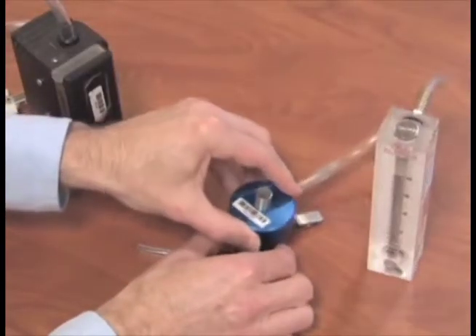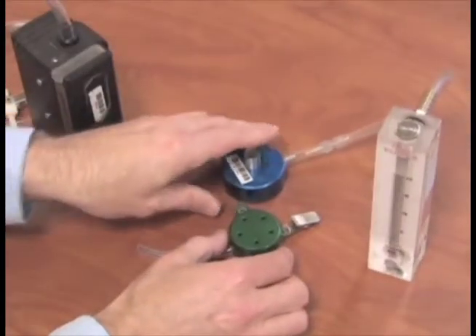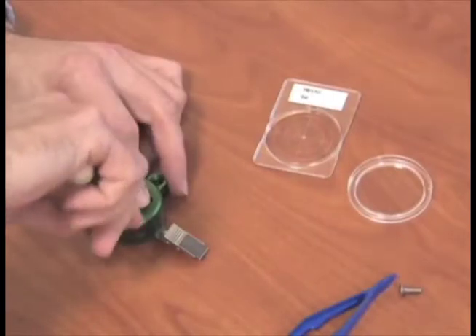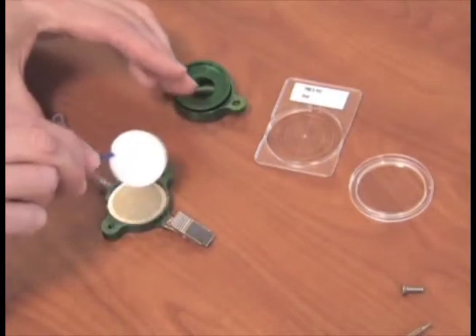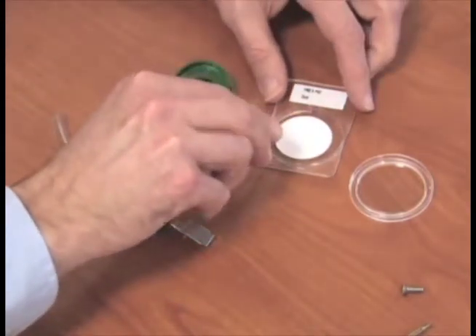Remove the calibration cap, rotometer, and tubing from the PEM. Unscrew the PEM, remove the calibration filter, place it in the Petri slide, and mark it for post calibration use.